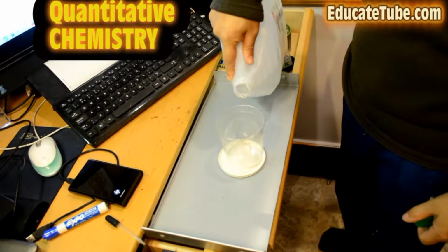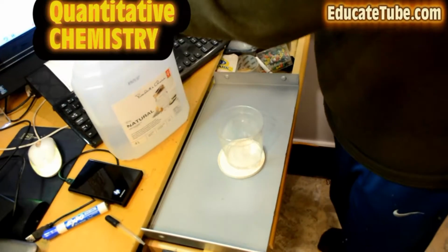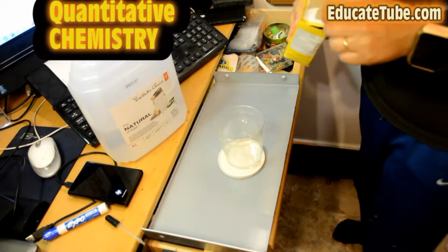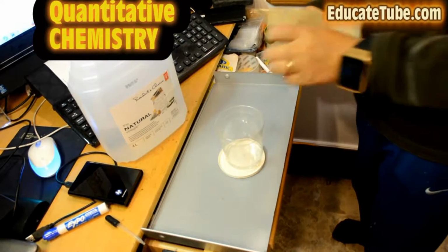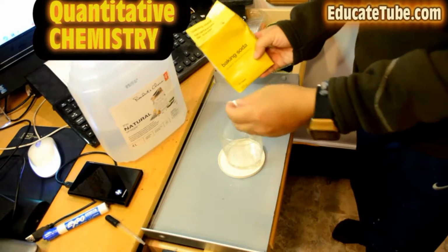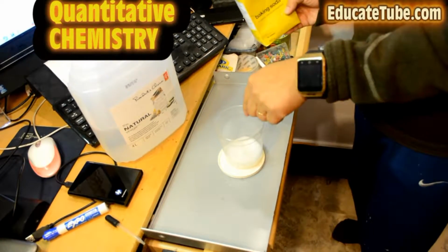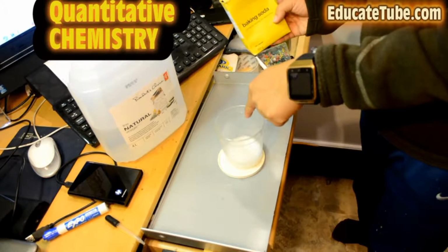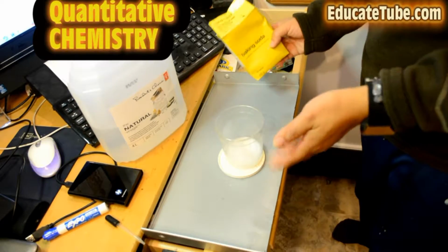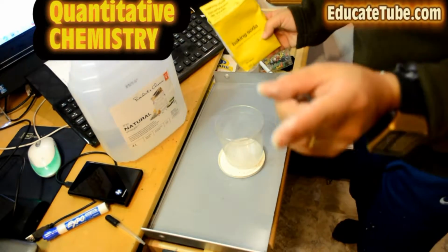So in today's experiment, we're going to mix acetic acid, which is vinegar, 5% acetic acid. Now it's supposed to be about 20 ml of acetic acid, and then we're going to add about 1 gram of sodium bicarbonate, or baking soda. Then we're going to predict how much gas, CO2, is produced. We know that this is a reaction where carbon dioxide is produced, but the hard part is how much, and that's what we're going to learn today.